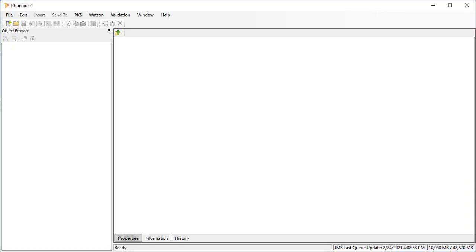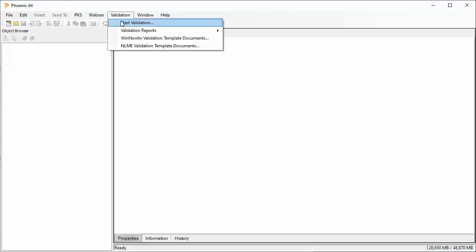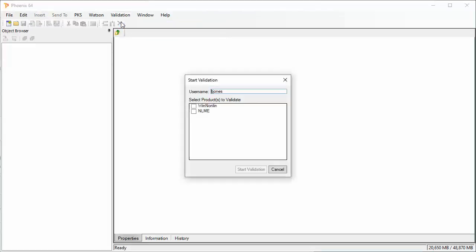To start the validation process, use the Validation menu, and then choose the product or products to validate. Here we will only validate WinNonlin.